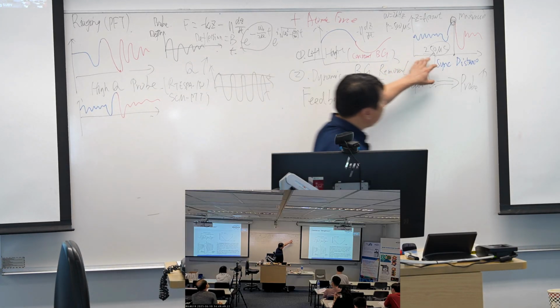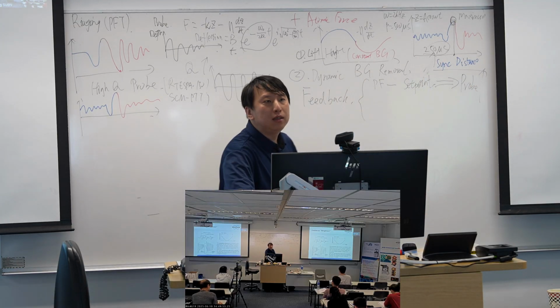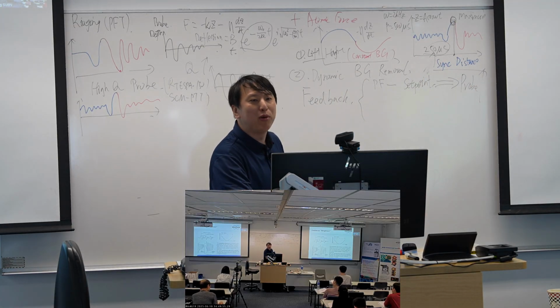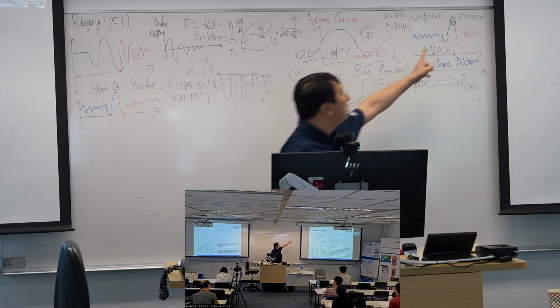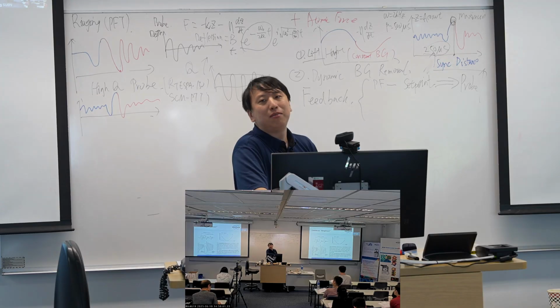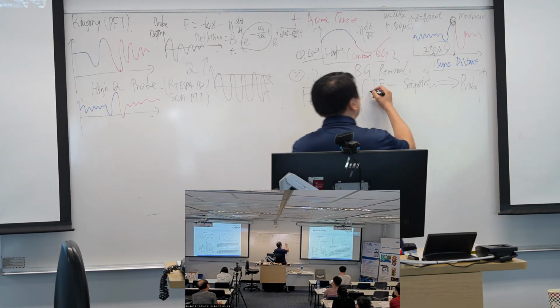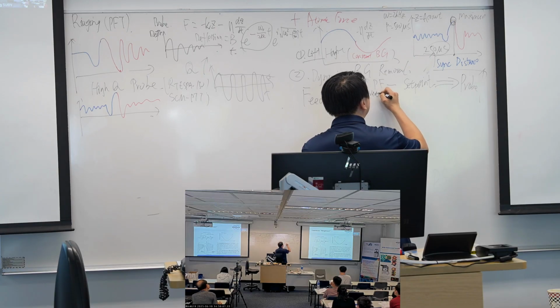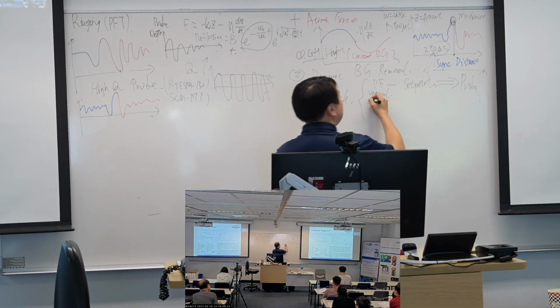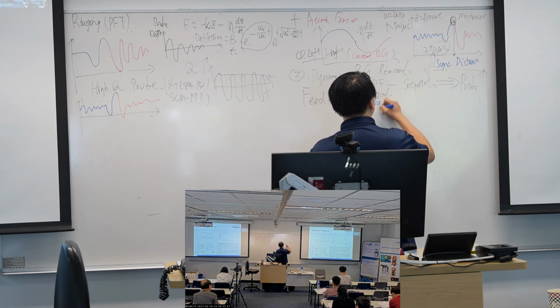So this sync distance is actually a time, and it defines at which time point I reach the lowest point, I reach my peak force, and then I read the vertical value at my defined sync distance.